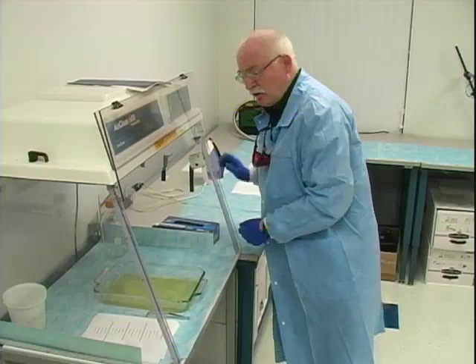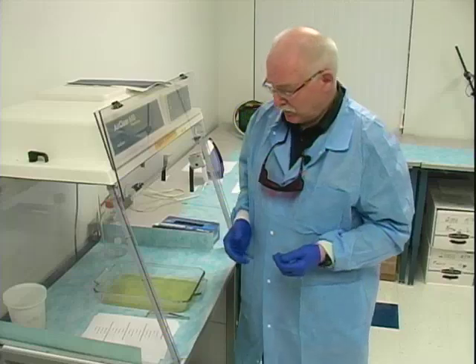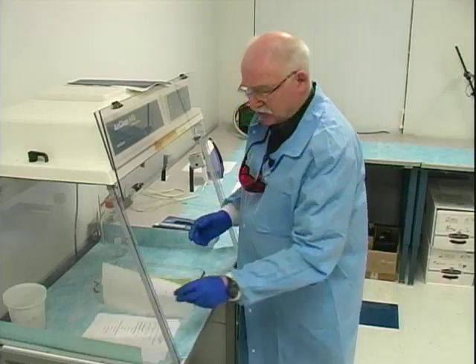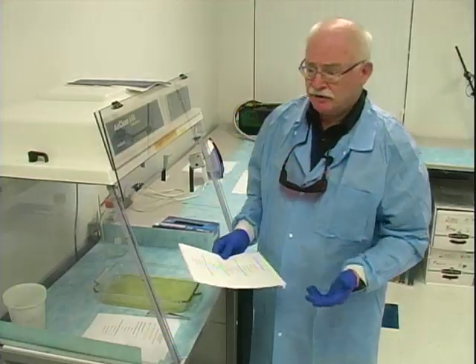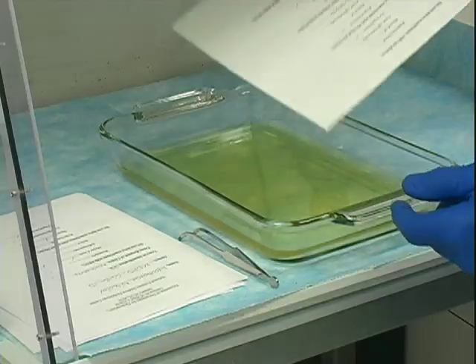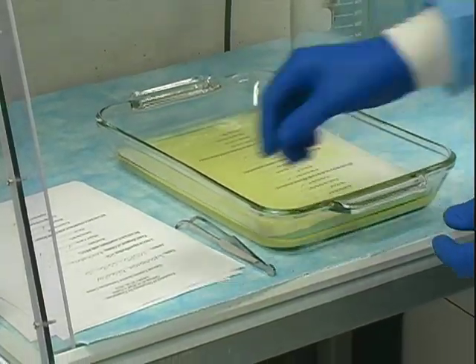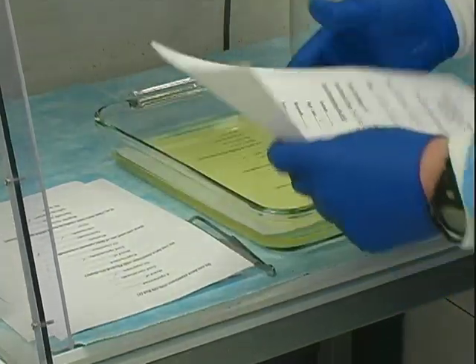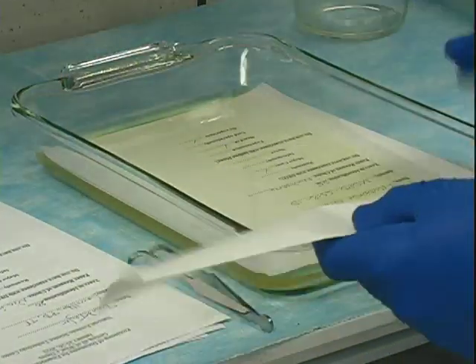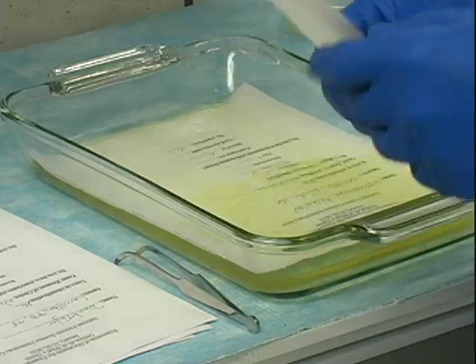We're now going to use the published formula for indanedione, which we have mixed. It's a very simple process, similar to any other amino acid processing procedure, where we immerse the exhibits in the solution, making sure that they are completely immersed.